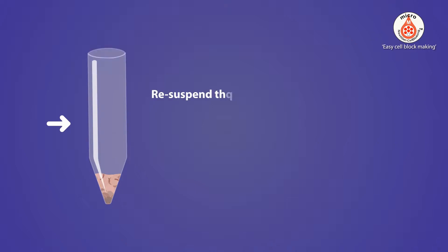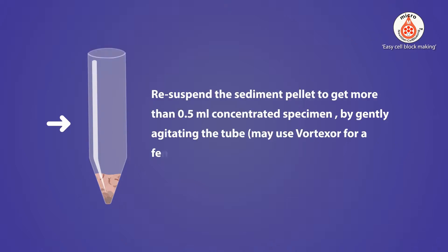Re-suspend the sediment in minimal supernatant to get more than 0.5 ml of final concentrated specimen.